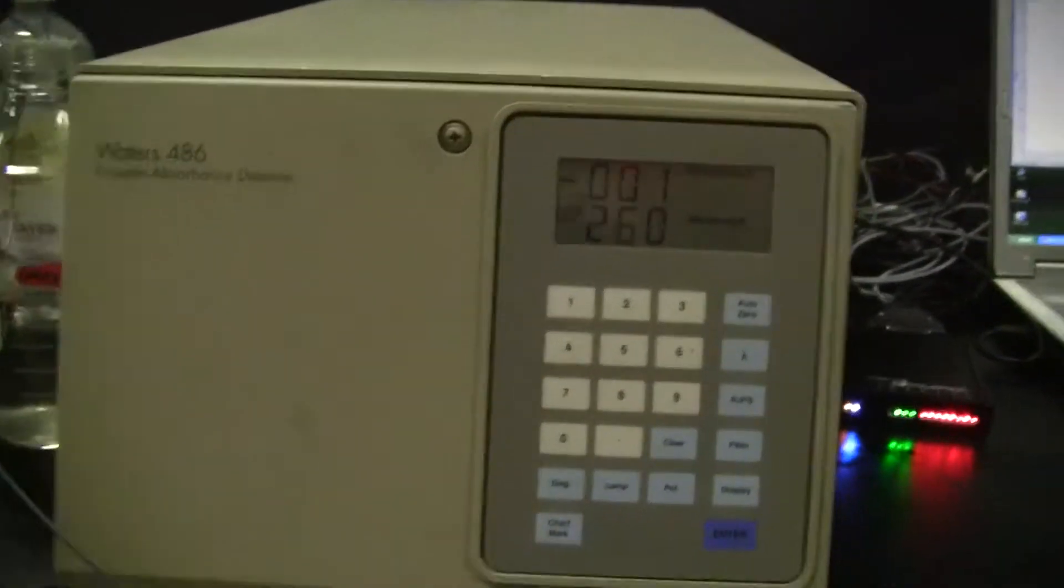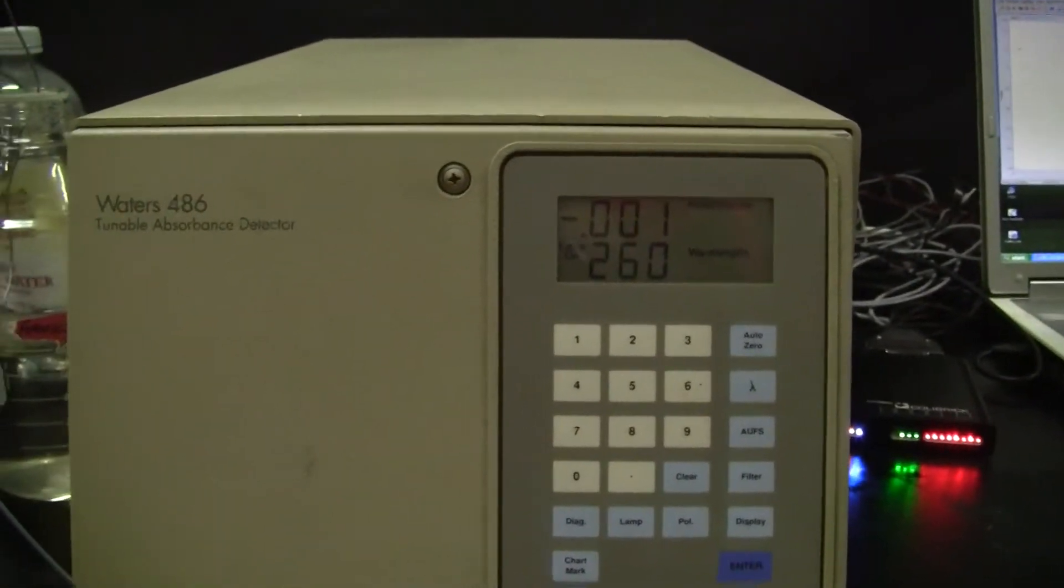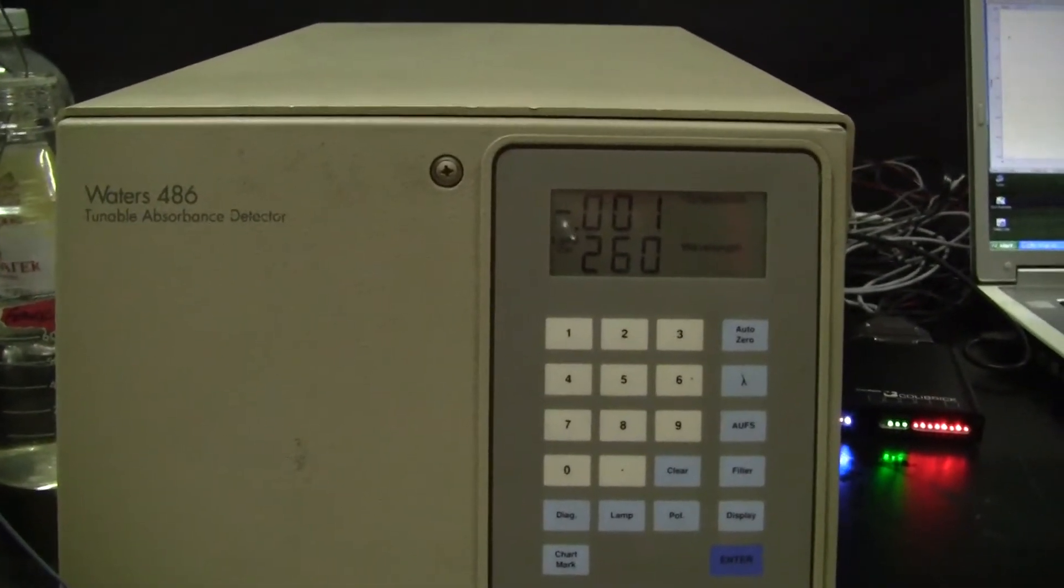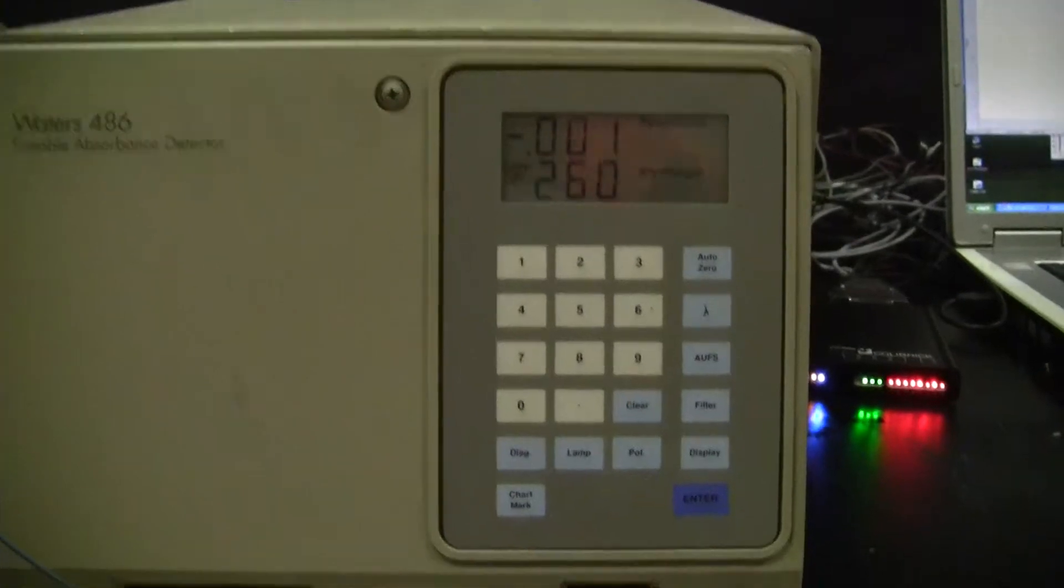Hi, this is Michael from HitechTrader. Today we're looking at a Waters 486 Tunable Absorbance Detector.